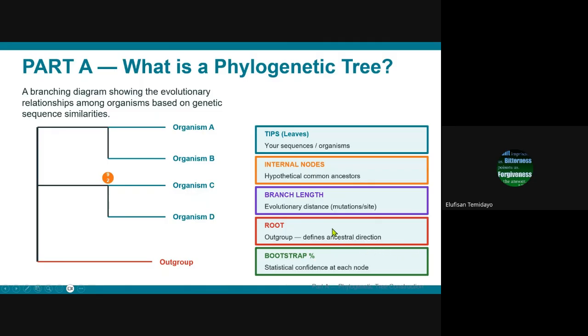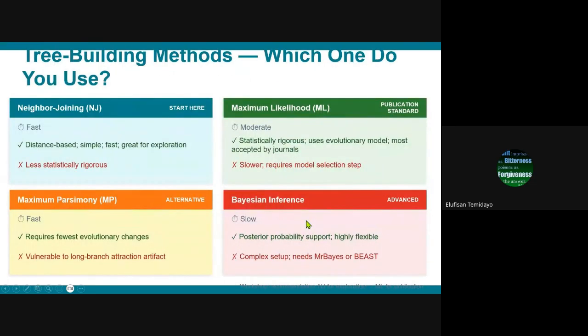Okay, and then the blue line shows the evolutionary length. Now, when we want to run a phylogenetic tree, from this part I'm going to change my class to a practical oriented class. So I'm going to be switching over now, and I'll be explaining a few things as we work together.